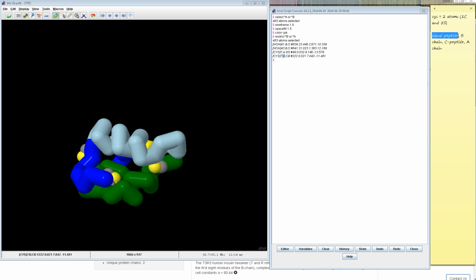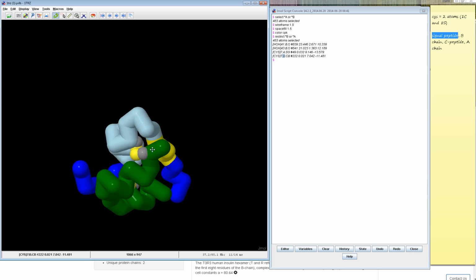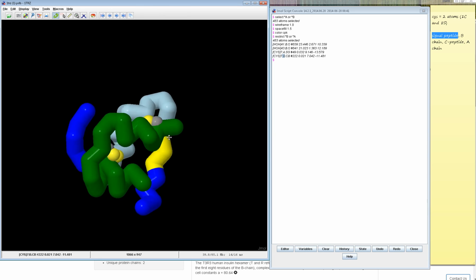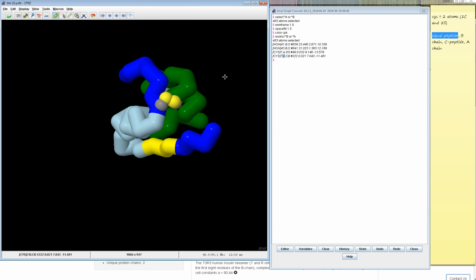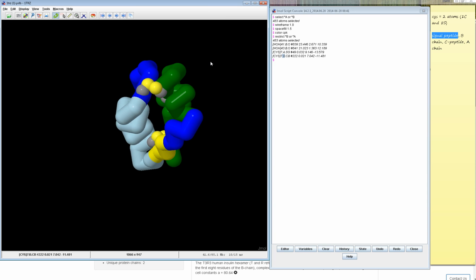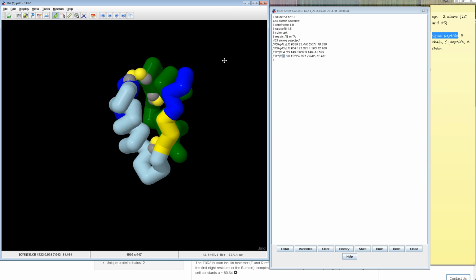The B chain and the A chain fold together into this nice structure that we see here. There was a C peptide that connected it all together, but we don't see that anymore. Part of the reason the C peptide was there at all was to hold the A and the B in relatively close position to each other so they could fold nicely together like this.